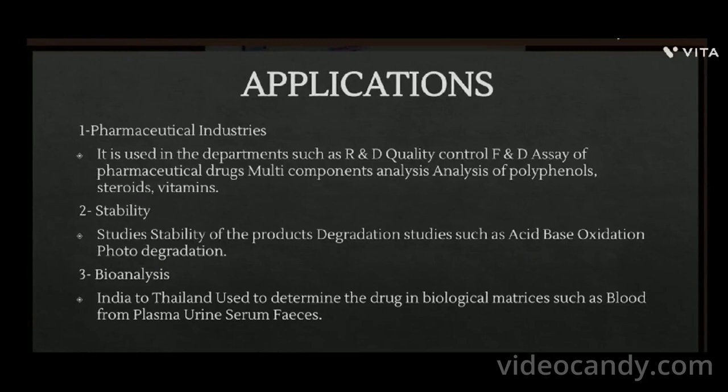Applications. Pharmaceutical industries. It is used in departments such as R&D, quality control, formulation and development, assay of pharmaceutical drugs, multi-component analysis, analysis of polyphenols, steroids, vitamins. Second, stability studies: stability of product, degradation studies such as acid-base, oxidation, photodegradation.